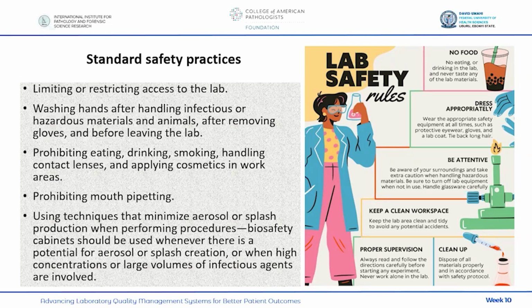Of course, mouth pipetting, the sermon has been going on for as long as I can remember. And I believe and I hope that nobody indulges in mouth pipetting anymore. So that one too is prohibited. Then you use techniques that minimize aerosol or splash production when performing procedures. And here it is recommended that if you're performing those procedures, they should be safely performed using your biosafety cabinets.